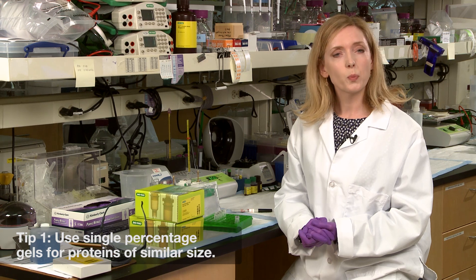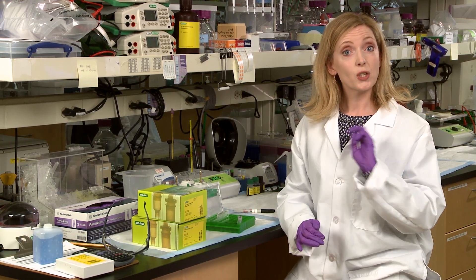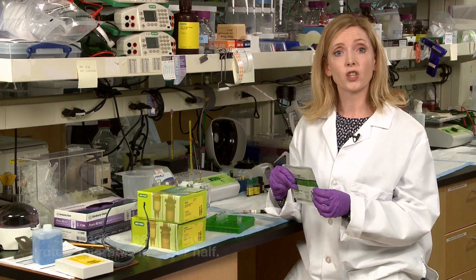Number one, use single percentage gels to separate proteins close in molecular weight. Number two, choose a percentage gel in which your protein of interest migrates in the lower half, since this is where optimum separation can occur.